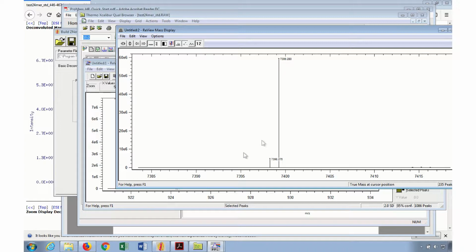The other way is if I have sulfur and I haven't told it, then I will generally end up with some data over here on the side of the peak. So that's kind of a way you can check whether your method is set up correctly, when you're working with your data: are you actually reconstructing a clean signal or are you getting these bonus peaks?